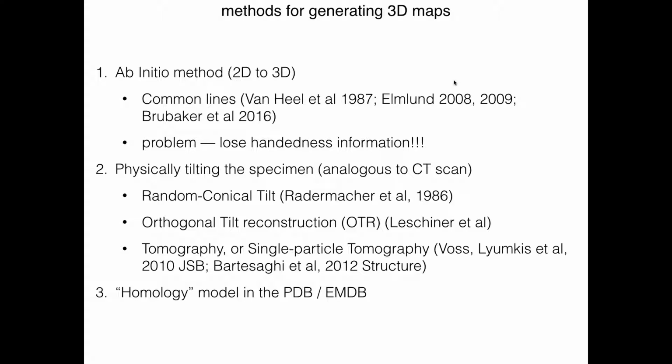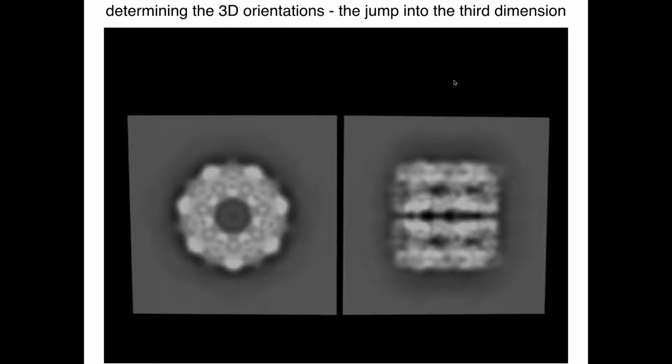And this principle of common lines then allows you to search for different orientations in 3 dimensions, and then lock down those two-dimensional projections. So this is just a movie demonstrating exactly what I mean. So if we have two images, these are class averages of Cryo-EM.